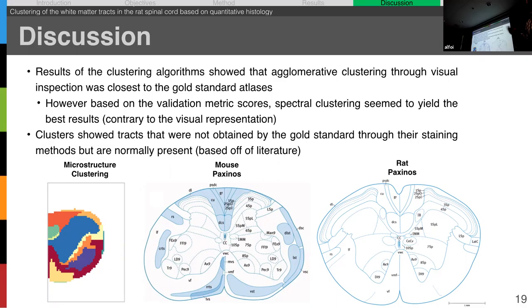The one that we used for our data was because we had segmented the data before that tool was finished. So we already had all the data before the machine learning based tool was done. That one is not machine learning based. It's more threshold based, and it looks at the intensities. It requires more user input, so you have to play around with the threshold levels on a small sample, and once you think it's adequate, it'll apply it to everything. That's the way this one works.